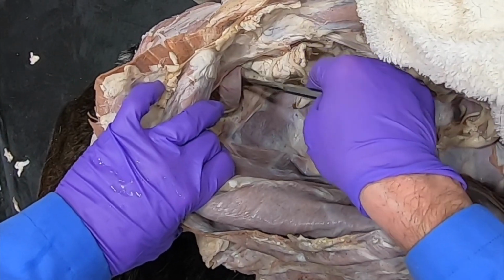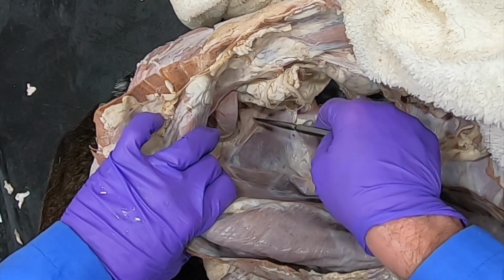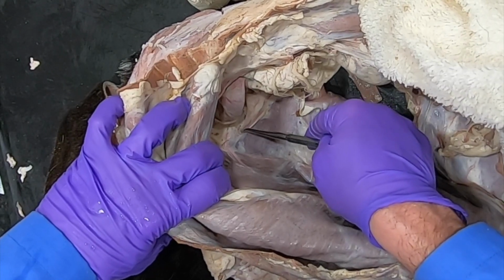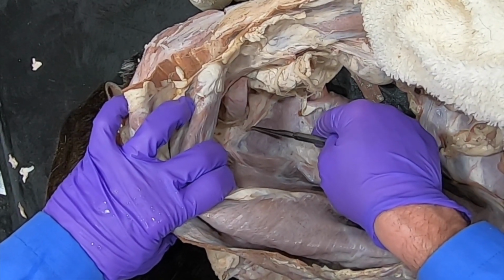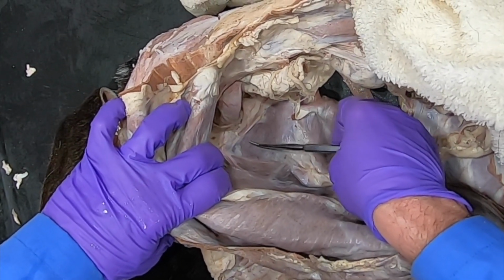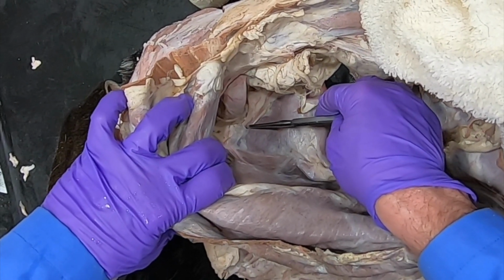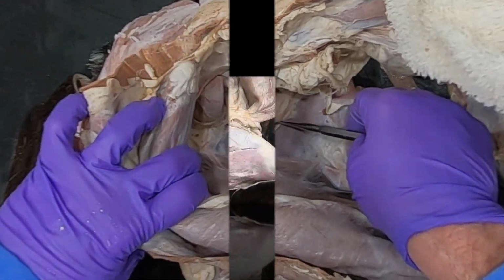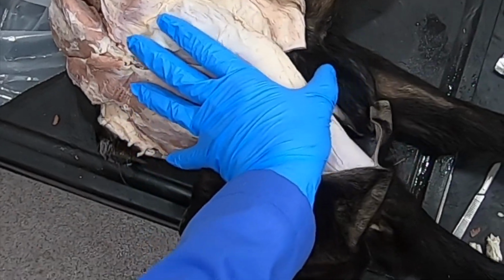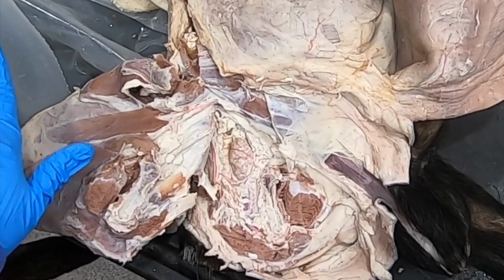Okay, looking at the other side, we can see the ductus deferens here, the testicular artery and vein here, going down through the vaginal ring, which is just a ring of peritoneum. Remember, the parietal peritoneum at the vaginal ring evaginates in to become the parietal vaginal tunic. So now we've cut it at the ilium and along the symphysis pubis so we could reflect the limb like such. And we will remove that limb.